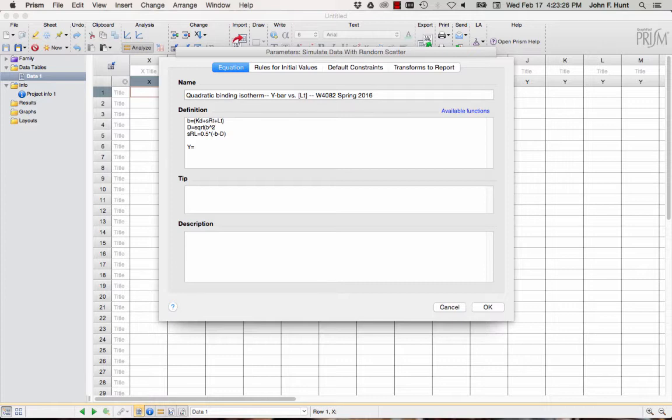So it's b squared minus 4ac. That's the discriminant. In this case, again, I know the quadratic equation underlying this by heart. It's SRT times LT, and we actually need the multiplying symbol there.